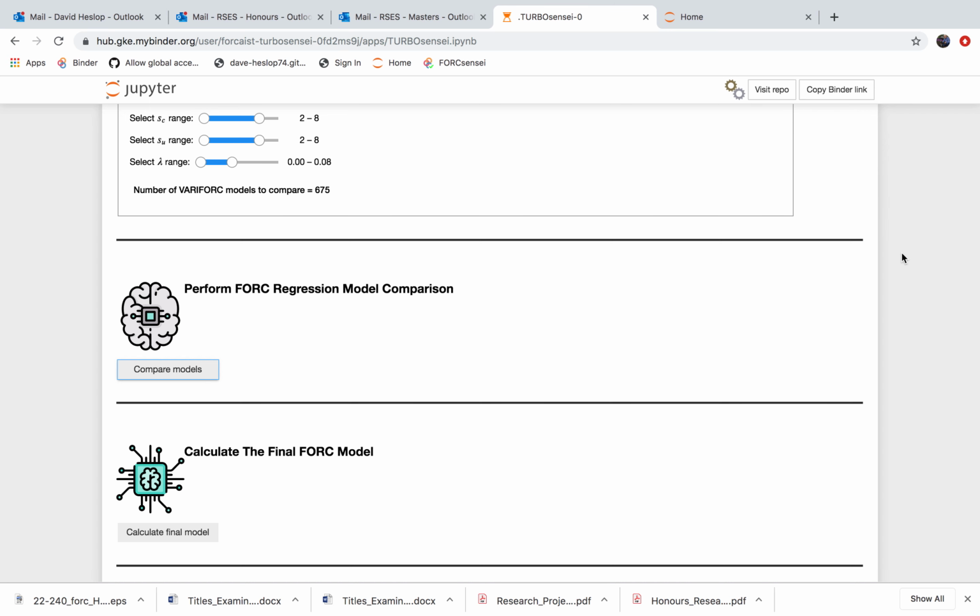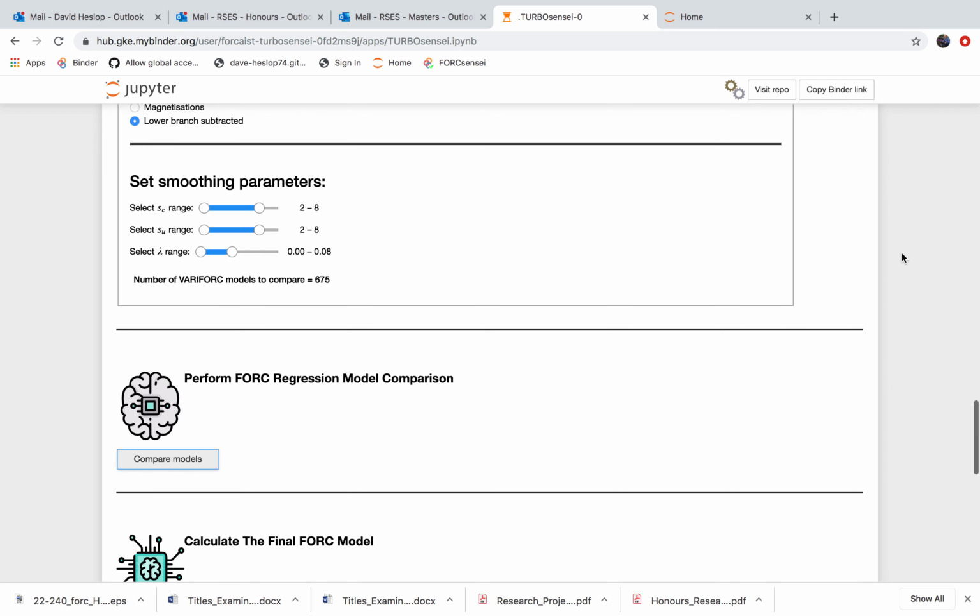That's all automatic. And of course, the good thing is that if everybody's using the cloud, we don't have to worry about people installing specific Python packages and the various issues that we hit before, where it seemed that almost everybody had a problem, each time a different one, and it was quite difficult to debug those problems remotely. By putting it onto the cloud, everything has the correct dependencies, everything should run consistently, and we shouldn't have any of those kinds of problems.